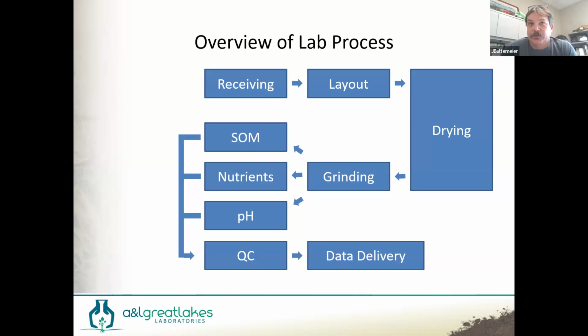But we're going to dry that sample. It can take upwards of 24 hours, depending on how wet the sample is, to get it dried. And we need to do that so that way we can process the sample accordingly. And by processing, I mean grind it.